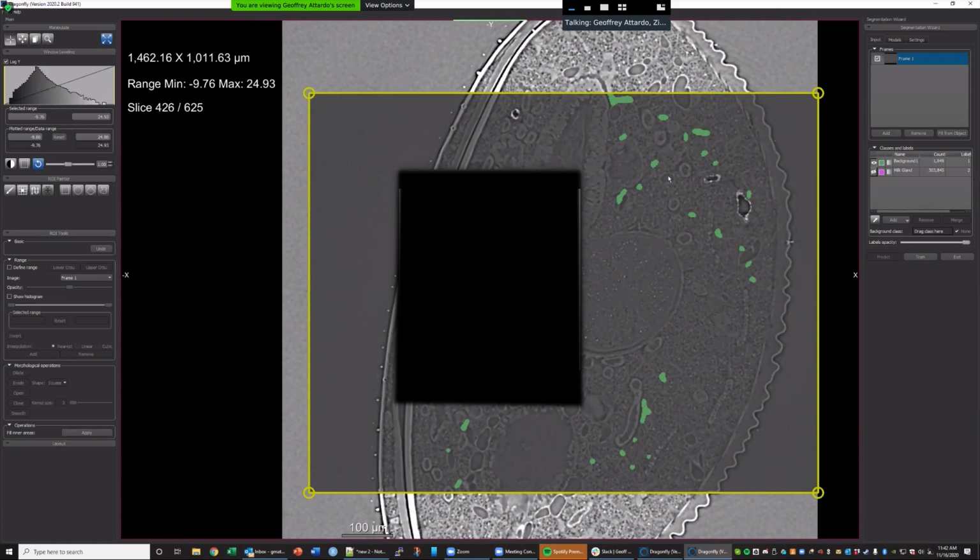So how many frames do you suggest training with? We could start with only one frame. If we do the manual preparation for the frames, I always start with one frame. Then I have a trained model, then I predict to other slices. Then I choose another one as a second frame, and train again.